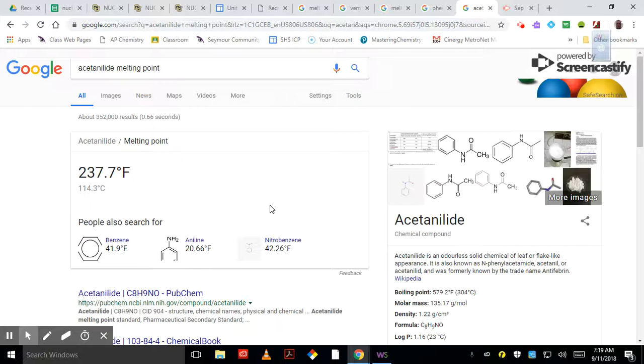Simply because if you're heating, if you don't control the rate on the machine, and there's settings on the machine for the temperatures where you're headed to. And what that does is controls how fast it heats up. There are some boosts on the machine where you can punch a button and it'll boost the temperature up a little bit. Be careful with those because there's a lot of residual heat. And you say, oh, I'll boost it up to like 90. And you'll find out you let go of the boost button and daggone it, you're already at 123. So be careful with that boost button. I see a lot of people ruin their samples with that.